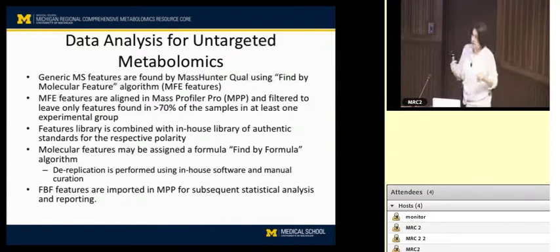So what the recursive analysis will do is go back and decide that you have a feature that's present in, say, 80% of the samples, but is not there in the other 20%. And so it will specifically go back and look to see if that feature is in the other 20%. So you ask yourself, well, why does it miss it in the first place? It's a good question, right? If everything's aligned and if the retention times are the same between all the chromatograms, why does the software miss certain features?